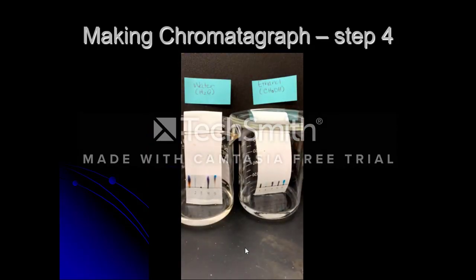So you can see the liquid moves up the paper and carries the ink, in most of the cases, with it. The process took about 20 minutes. The ethanol has a watch glass on top to keep the vapors from escaping. That makes it go a little bit more quickly.